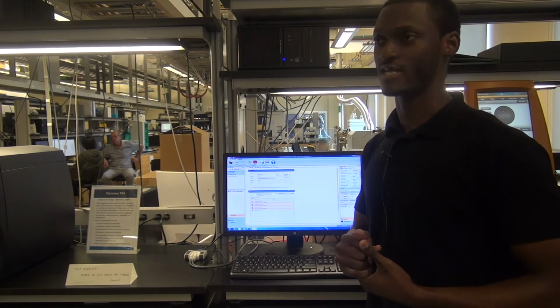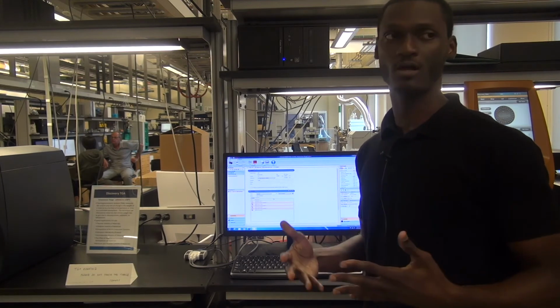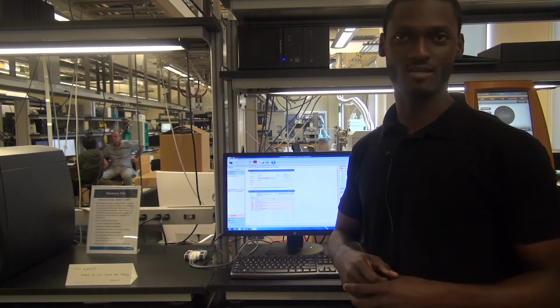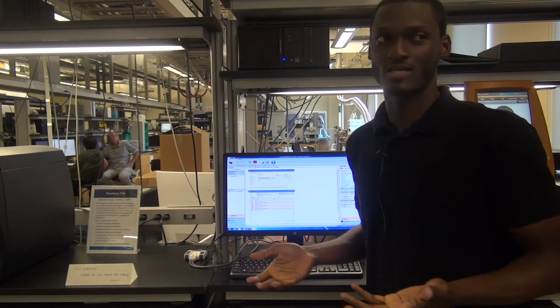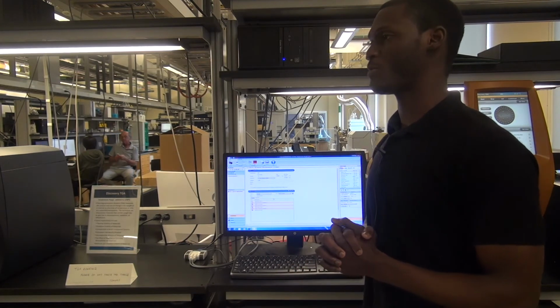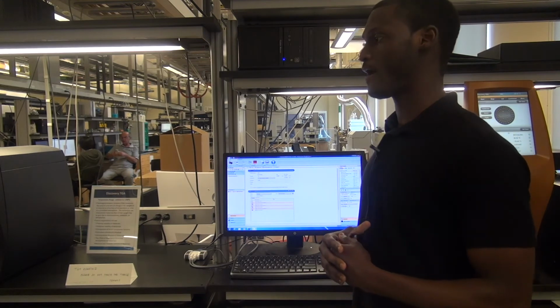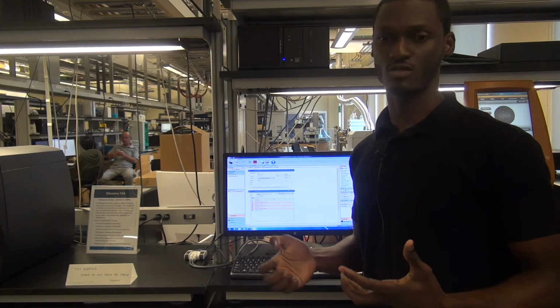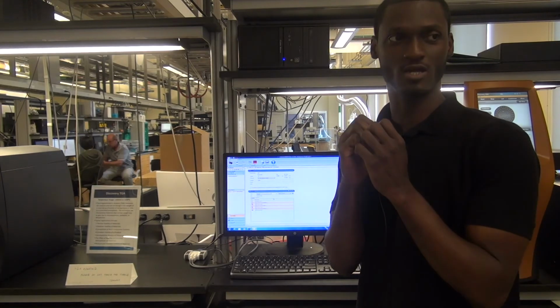A good example of that is when you're doing polymerization, for example. Typically your last step for making a polymer is precipitating it in a non-solvent. Of course, it's a non-solvent, so the polymer doesn't actually like to be in there. So when you take that polymer out and you dry it and filter it and whatever else you do, it's not going to be in a very comfortable configuration, because essentially once you drop it into that non-solvent, it's going to just shrink up.